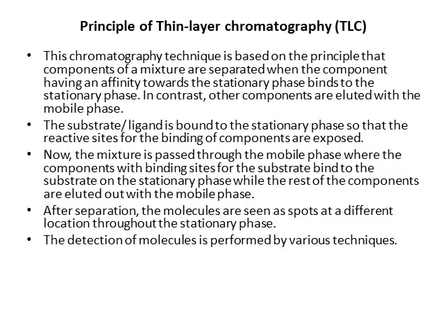The principle of thin layer chromatography, or shortly TLC. This technique is based on the principle that components of a mixture are separated, with a component having an affinity towards the stationary phase binding to the stationary phase. The other components are eluted with the mobile phase.